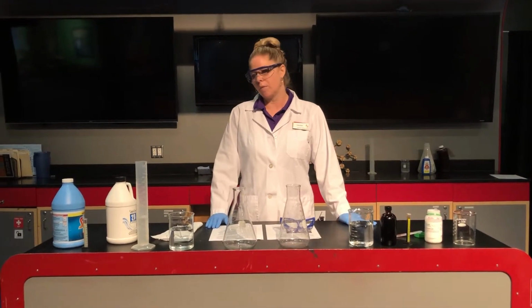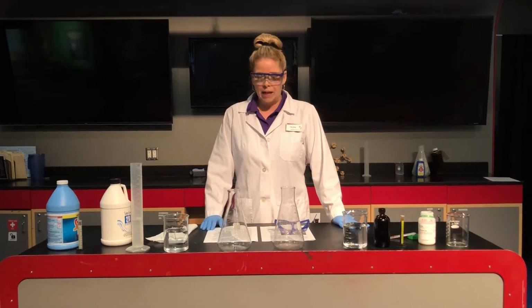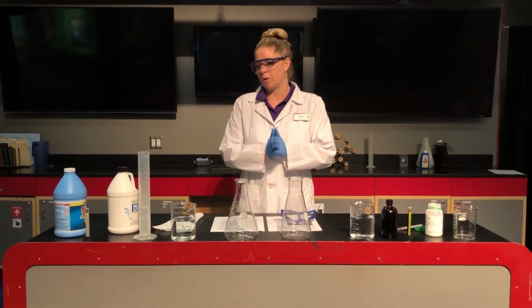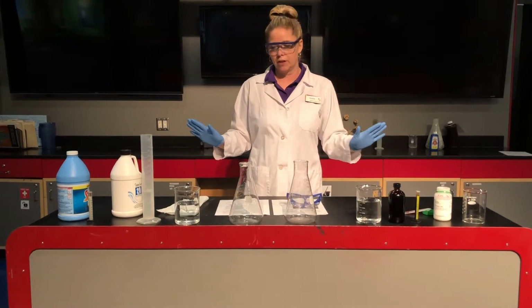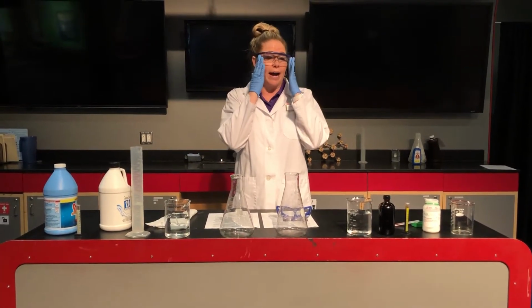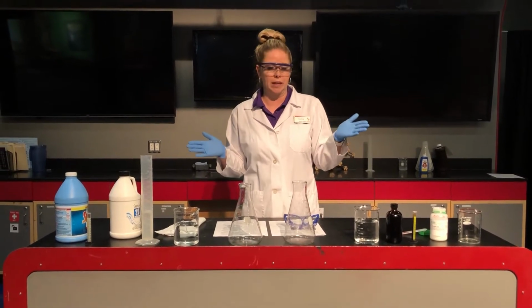Today, the chemicals we're dealing with may not be ones you have at home, but you might recognize some of them. And we're going to talk about each one of them and then how they might combine to form a reaction. So anytime we do a chemistry experiment and we're looking for a reaction, remember we want to use all of our senses to see if a reaction has occurred. So we want to look with our eyes to see if something happens. Maybe it'll change color, maybe it'll do something exciting.